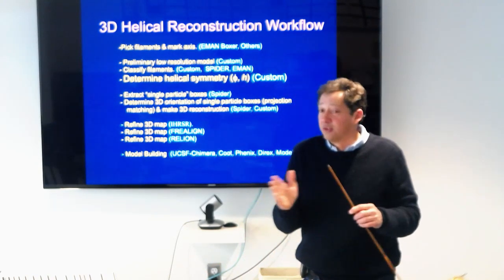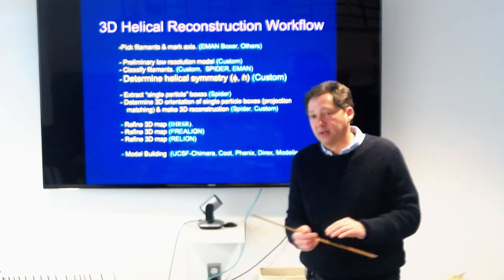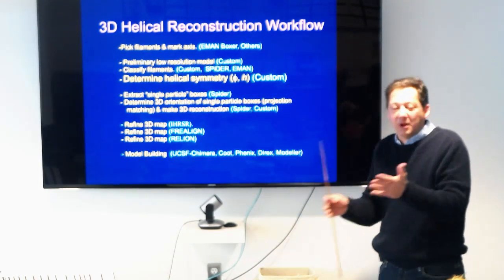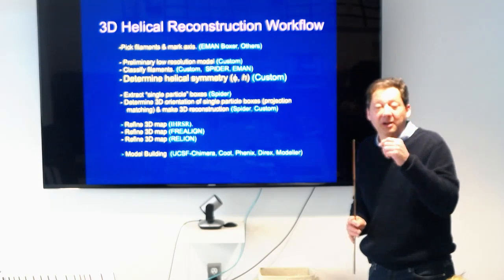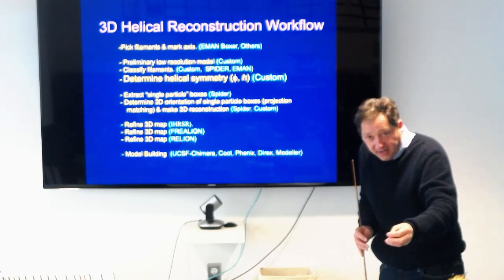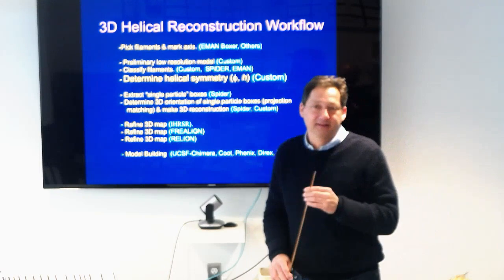And certainly there is nothing wrong with trying, if you are not sure, try a few, and then see the one that actually works. Because it could be that you have two alternatives and you're not absolutely sure, because your initial data is not that good, since you're trying to define the symmetry with only one specimen. So you need to have the right one to bootstrap you into the right one. Yeah. That's right.